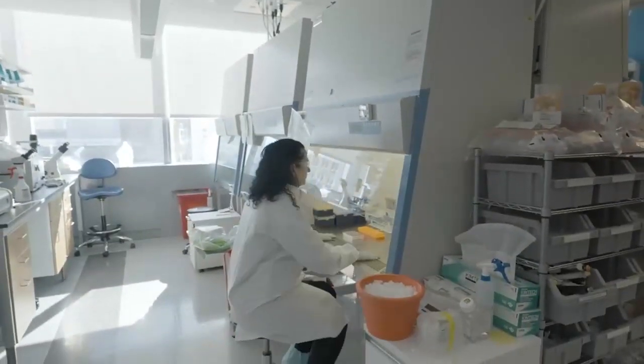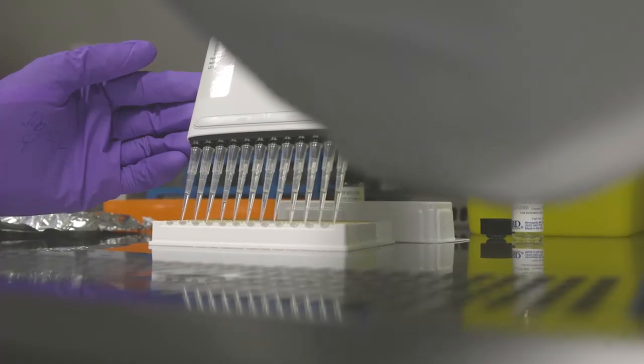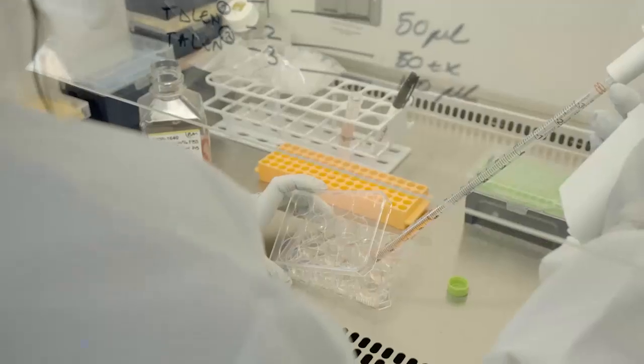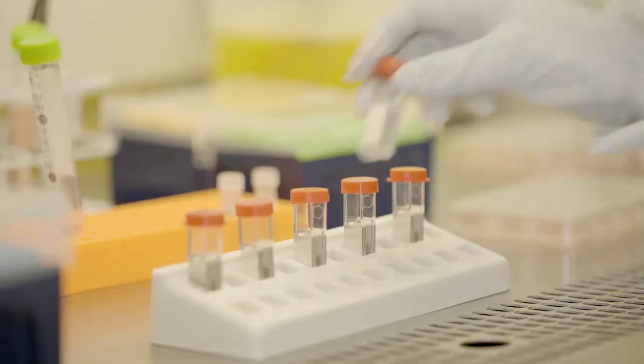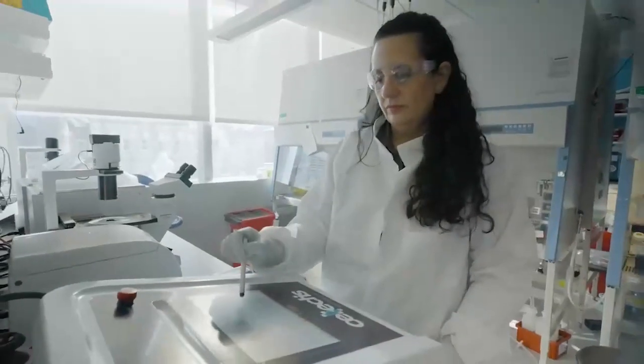The innovation team spends most of their time in the BL2 lab, that means Biosafety Level 2 lab, which is the place where we are allowed to work with viruses, and where we can modify the blood cells from the patients to express the CAR, which is delivered via a virus. After we have incorporated the virus into the blood of the healthy donors, and specifically into the T cells, we use an electroporator to incorporate the TALEN into the cells. Once we bring it in, the TALEN will express and will be able to modify the genome and generate the modifications that we want, the modifications that will also make each of our UCAR-T cell products unique.